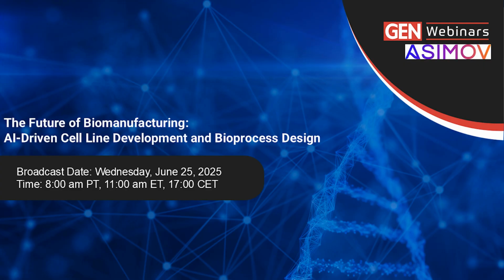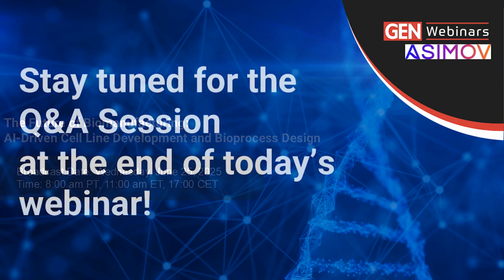During his presentation, our speaker will cover case studies that demonstrate how this system delivers high-titer clones in less than 4 months for monoclonal and bispecific antibodies. Finally, he'll discuss broader capabilities for integrating multi-omics and bioreactor-scale models to further optimize growth, productivity, and quality.